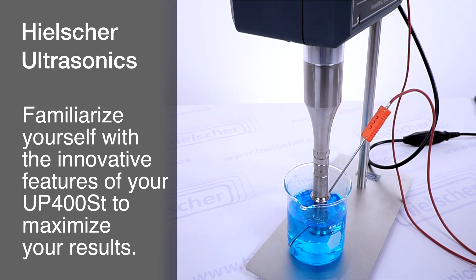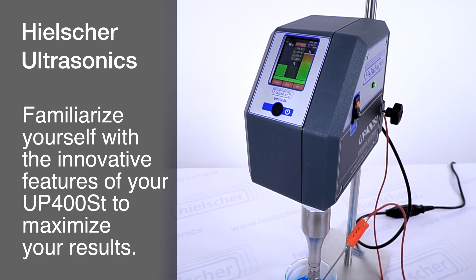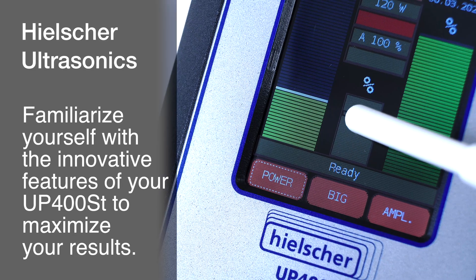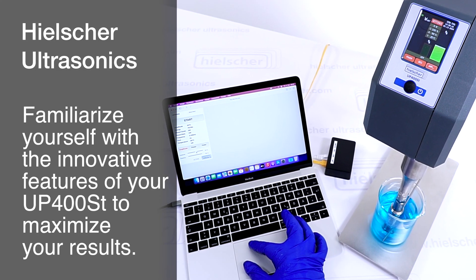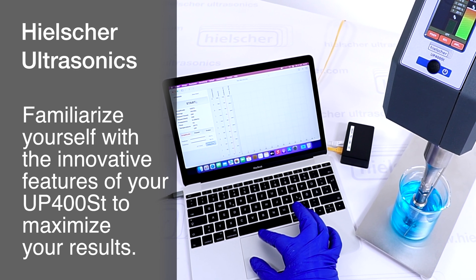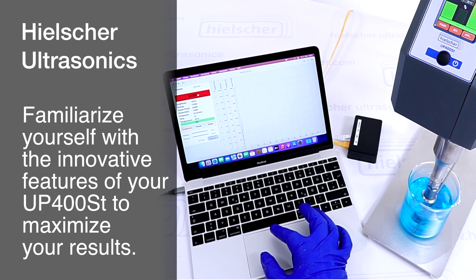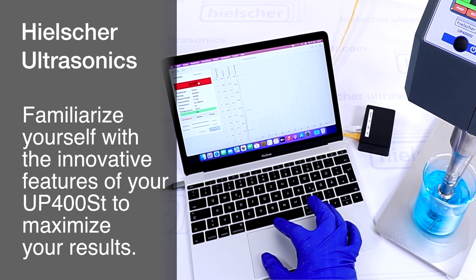The UP400ST ultrasonic processor includes numerous innovative features. From cycle mode and amplitude control to remote control via your browser, these functions are described in the user manuals. By familiarizing yourself with these features, you can establish a solid foundation for successful sonication processes and achieve optimal results.